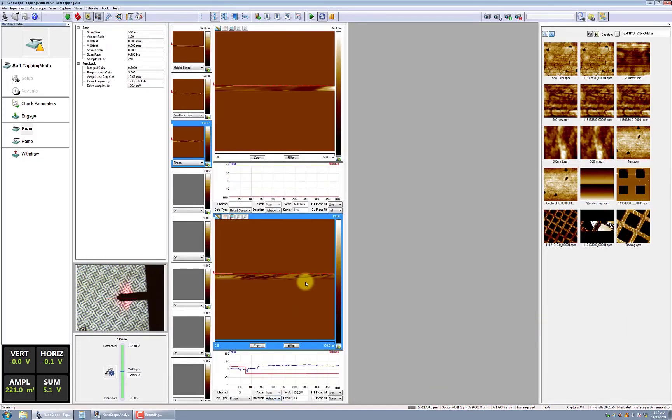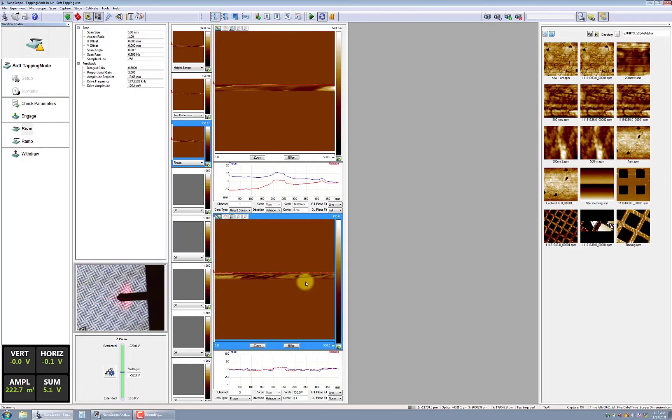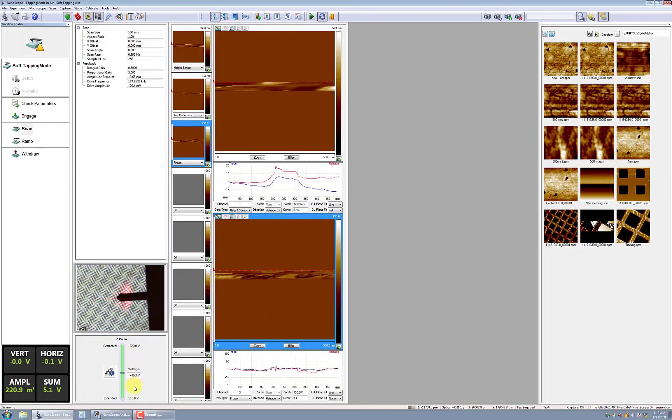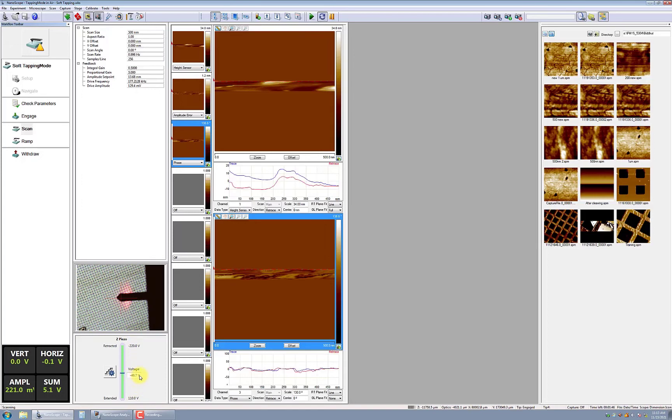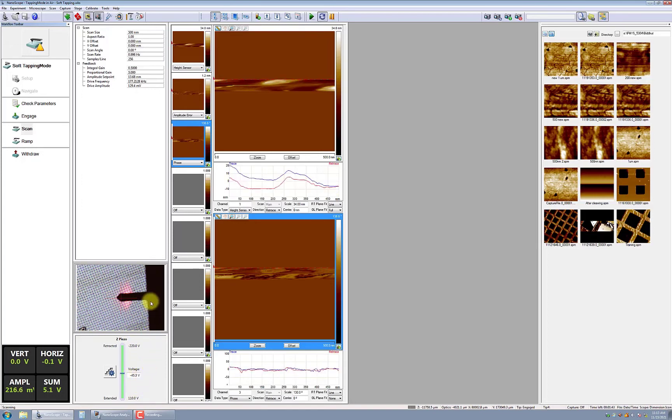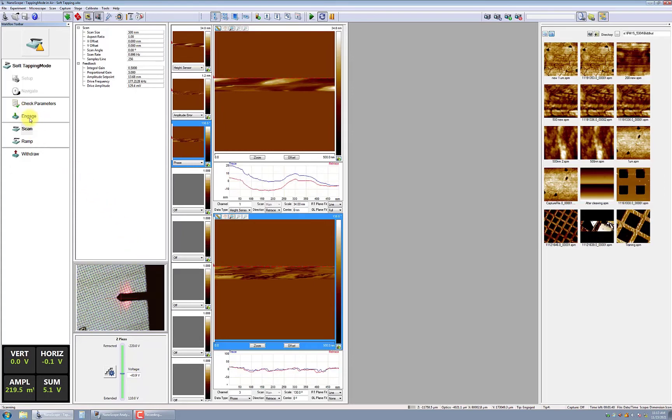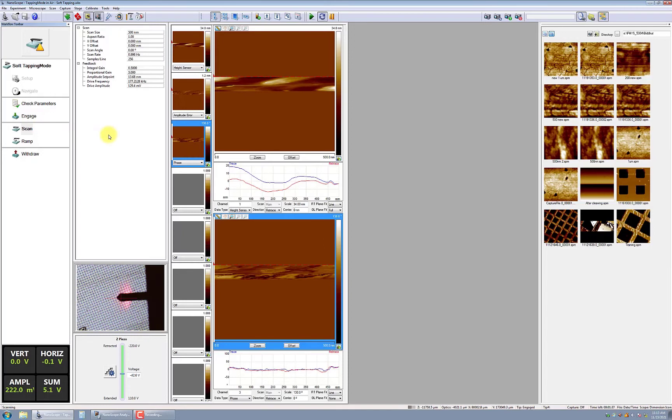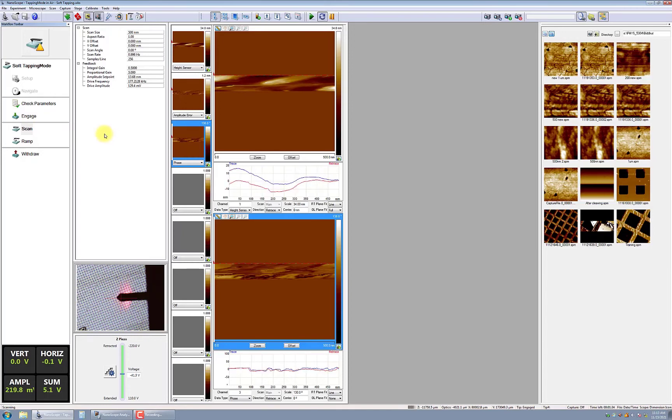Verify that the Z-Piezo voltage range is set to negative 55 volts to positive 55 volts. If not, this suggests that the probe did not fully engage with the sample. Click Engage again and repeat fine-tuning. If the Z-Piezo voltage is still out of range, you will likely need to replace the probe.